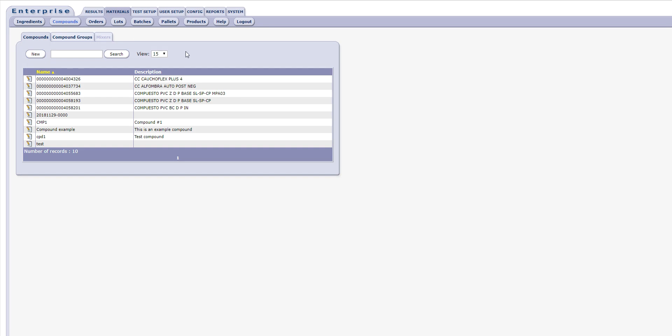Please note that access to the Materials tab and its contents requires user membership in a privileged group that has the appropriate privileges.